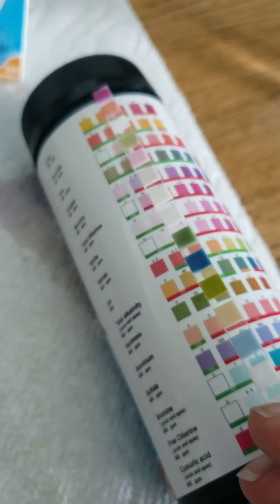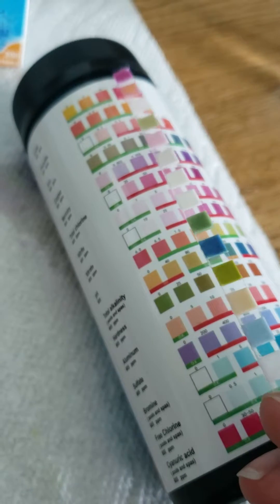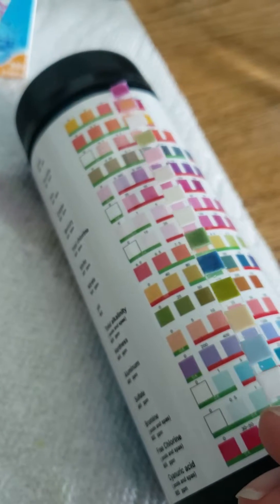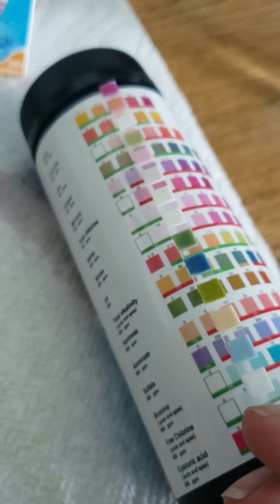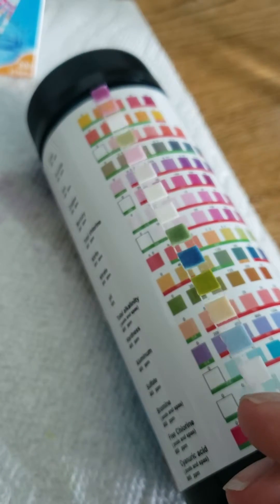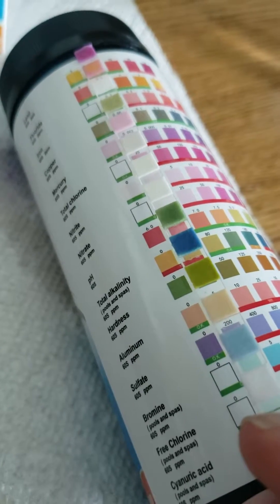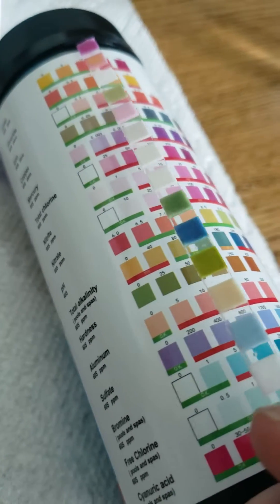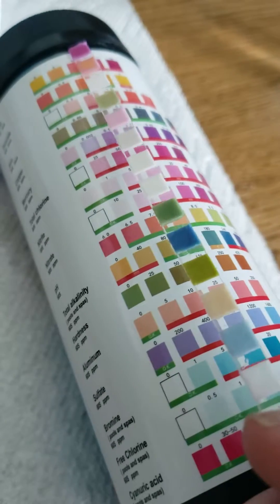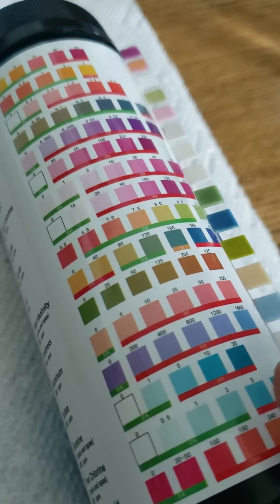The next one down is hardness — hardness looks to be about 25. Aluminum is negative, closest match is negative. Sulfate: going across, it looks like it's high — it's 1600 there.